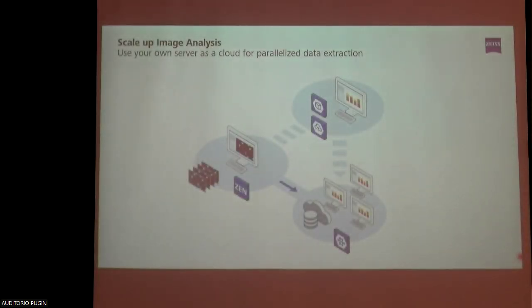Okay, what we can also do, of course, is we can basically scale up image analysis. What we have, but you probably also know that you could have a server somewhere at universities, you could have some free-floating licenses with image analysis, and everyone who just needs the image analysis license modules, they can simply have it and execute it on their own laptops, on workstations, computer, etc., so that you can really parallelize image analysis.